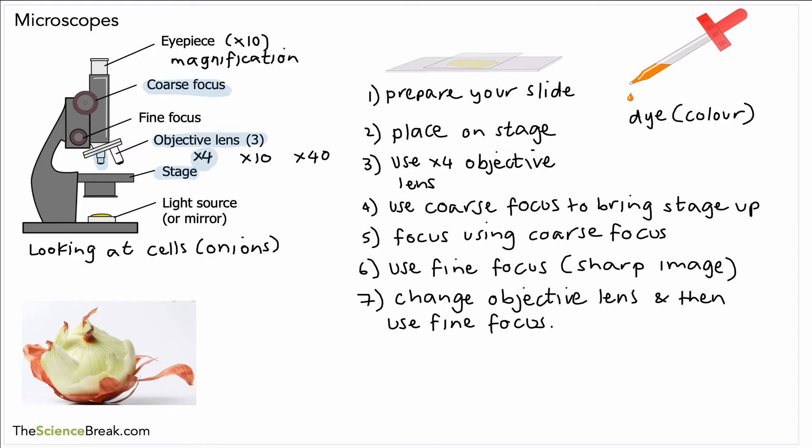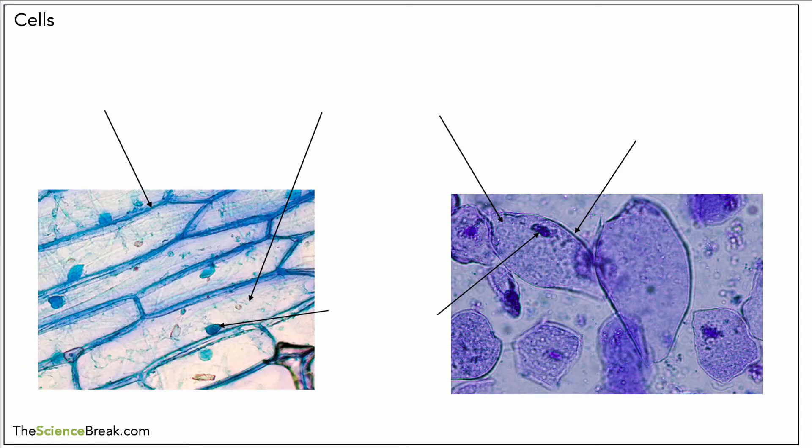Here we have two sets of cells. On the left hand side these are onion cells and we're looking at these using high power, the high power objective, in other words the one with the most magnification. Over here we've got some cheek cells and these come from the inside of the cheek. They're quite easy to set up as well.